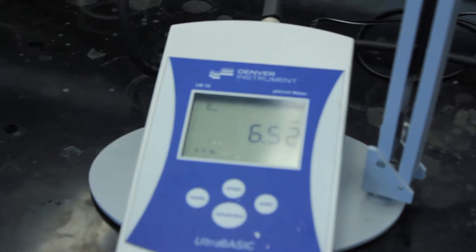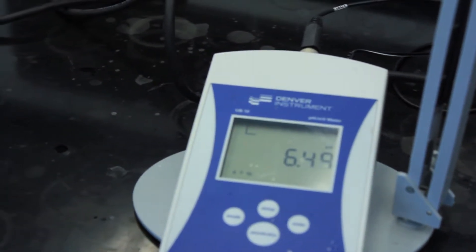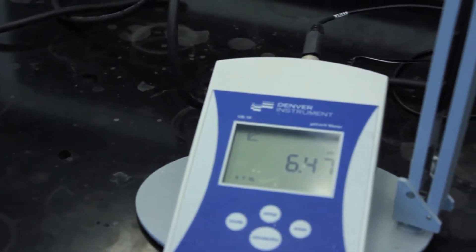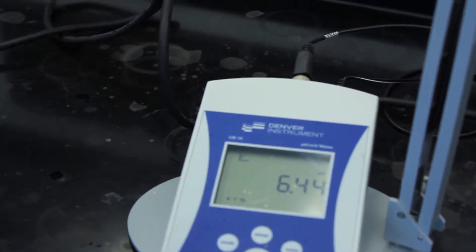Once you approach your equivalence point you have calculated, decrease the volume of sodium hydroxide being added. You can adjust the stopcock to add a few drops at a time and decrease the volume of titrant added to about 0.2 milliliter aliquots.